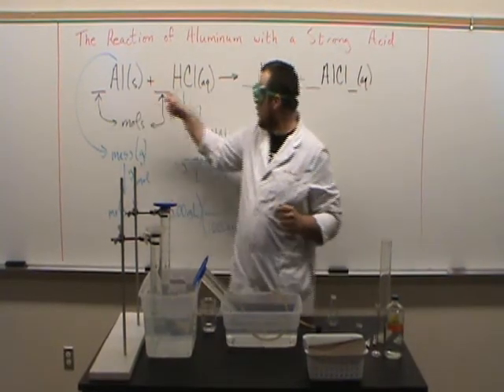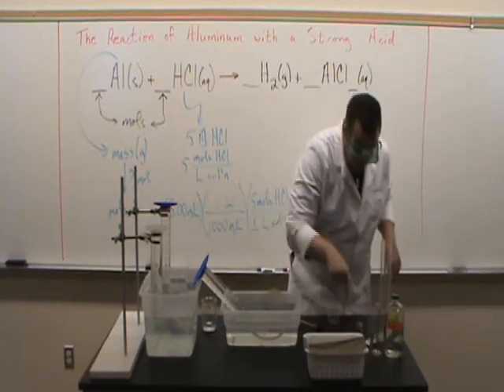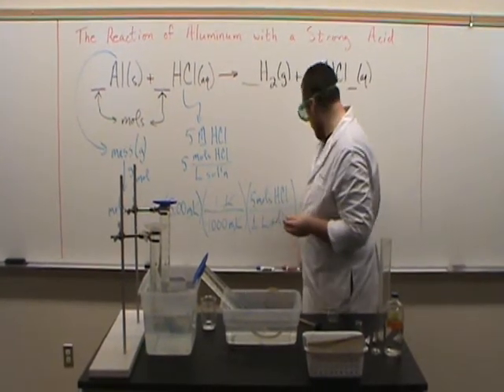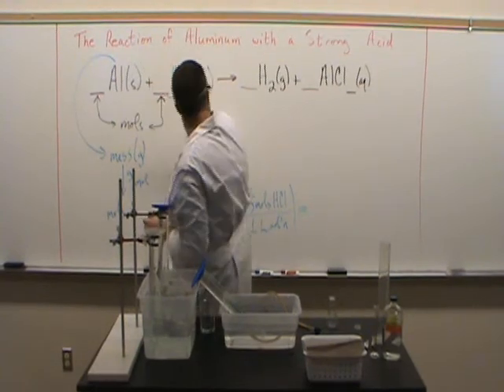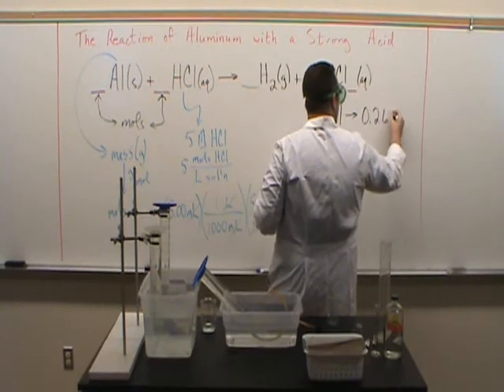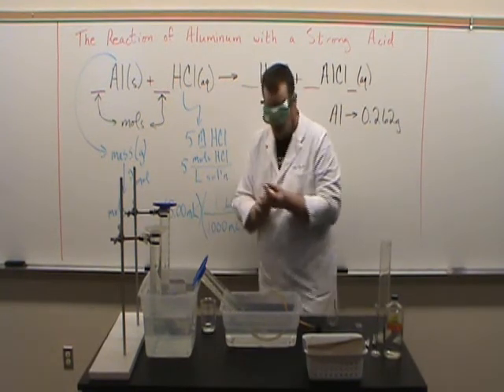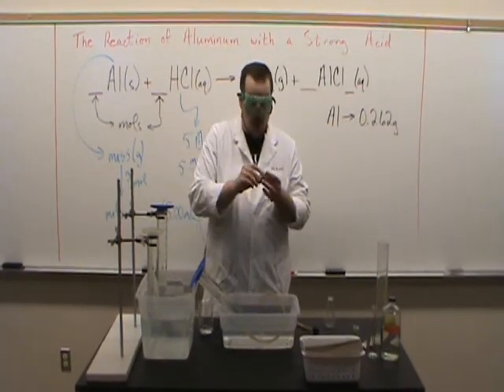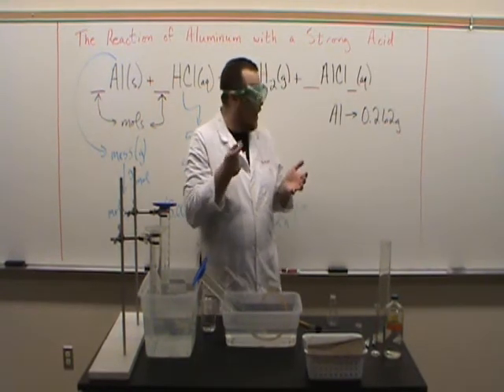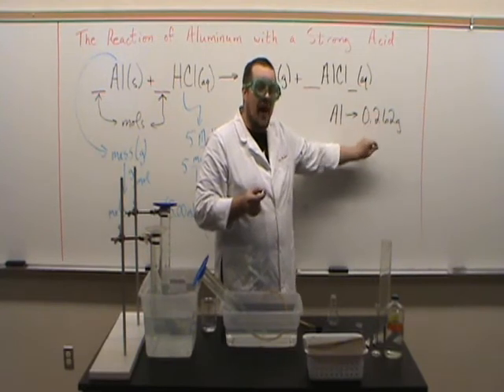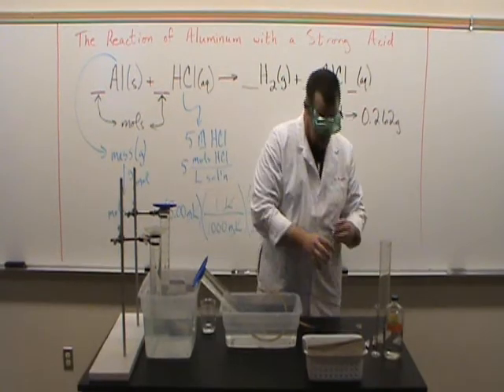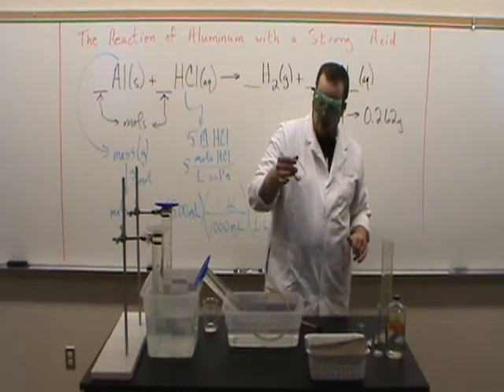Now, what do we need? We need aluminum. We need HCl. So I pre-weighed a couple little pieces of aluminum over here, so I'm going to use this one, and this one has a mass of .262 grams. Now, as it says in your manual, you want a piece that's about .25 grams. But don't waste a lot of time getting exactly .25. As long as you know how much you have, you can figure out how many moles this is. So .262 was close enough for me. Let's get that in our reaction vessel.